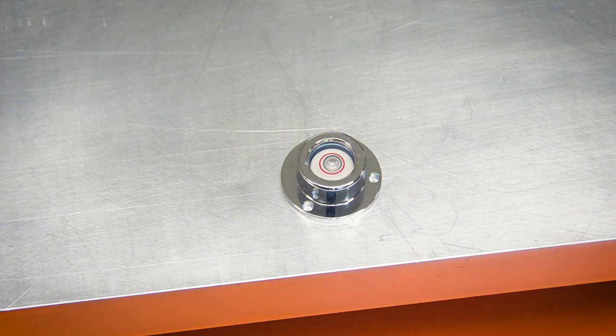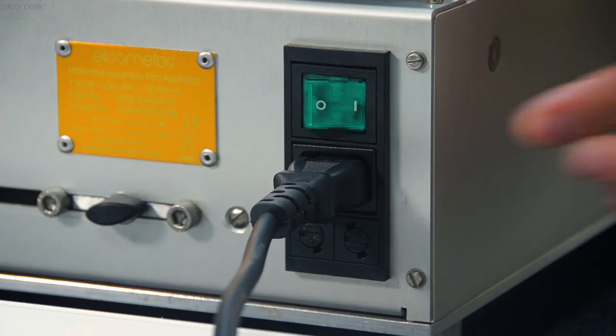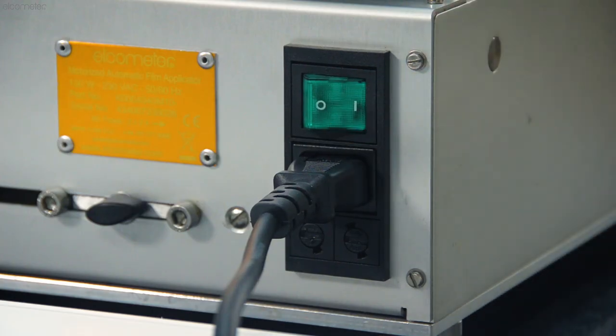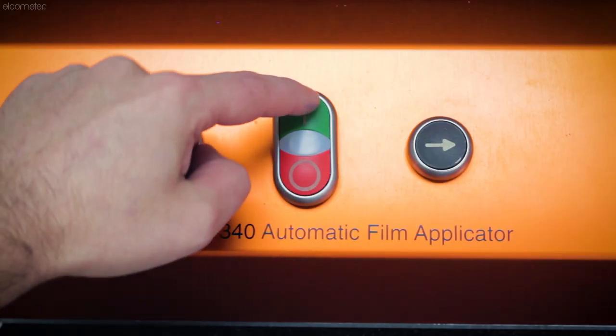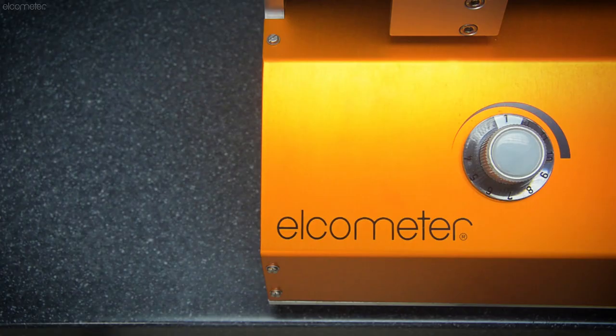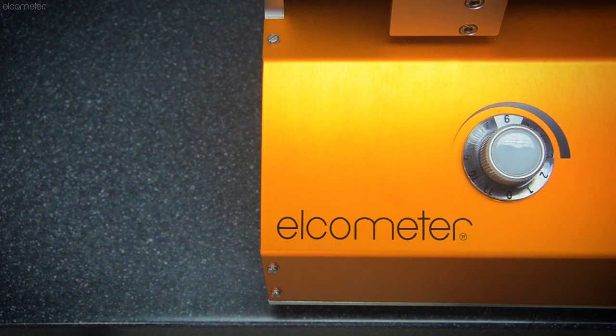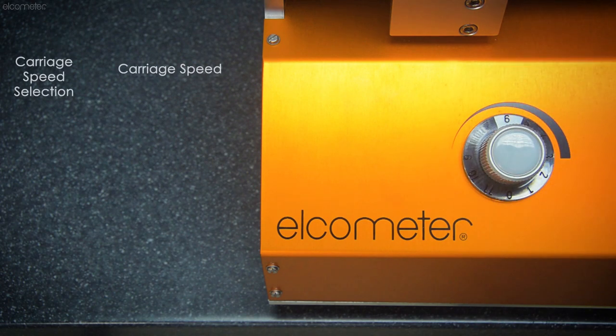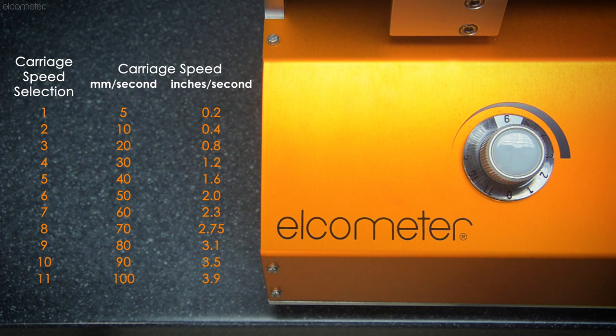Next, switch the Elcometer 4340 on using the switch at the back of the machine, followed by the green button on the control panel. Now you can set your carriage speed—in other words, how quickly the film is applied. Simply set the dial from 1 to 11 to choose your desired speed. This should only be done when the carriage is stationary, not while the carriage is moving.